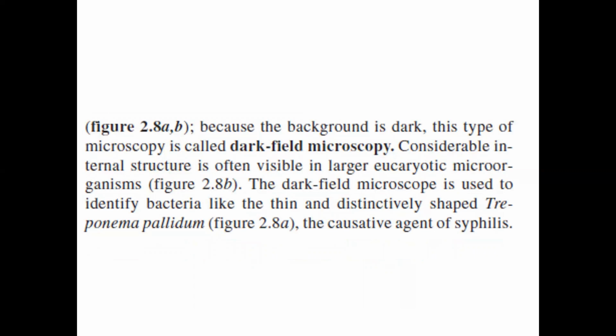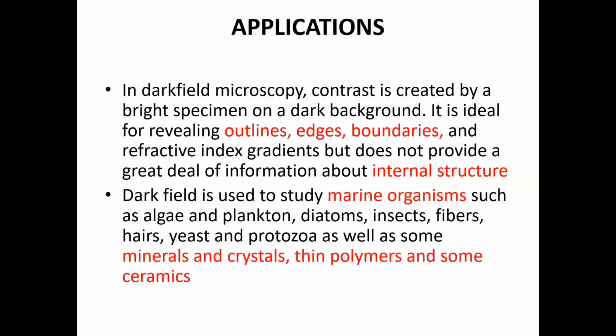So because the background is dark, this type of microscopy is called dark field microscopy, and internal structures are often visible, and larger eukaryotic microorganisms can be studied by this type of microscopy. Dark field microscopy can be used to study the causative agent of syphilis, that is Treponema pallidum.